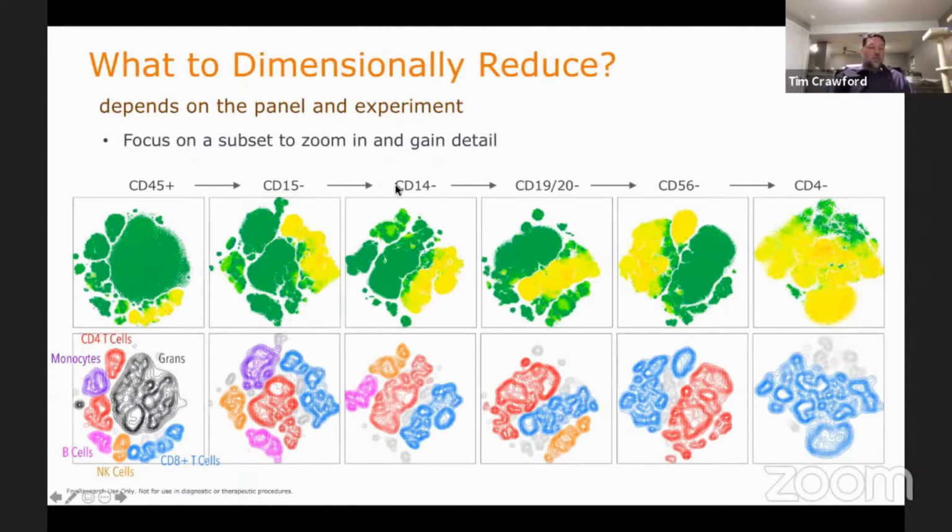And you can do that with effectively dump gating lineages using lineage markers, or drop all of those into the same color and get rid of all of the lineages at once, focusing in on the particular population of interest. Here I'm gating for CD8 cells, which are overlaid in blue, heat mapped up above, and you can see that it's spreading these events out so that I see distinct peaks or regions of density that I can then cluster on top of, or even manually gate apart and see what those features are.